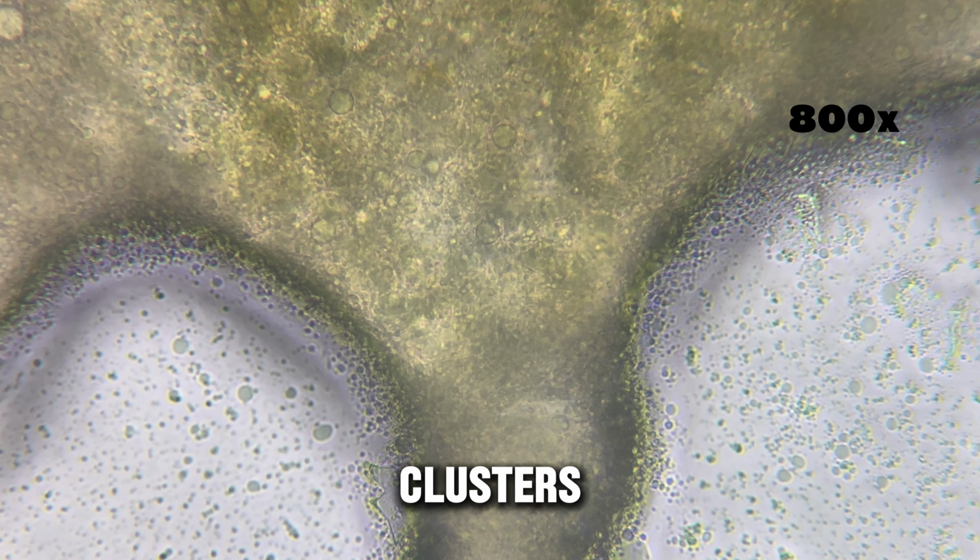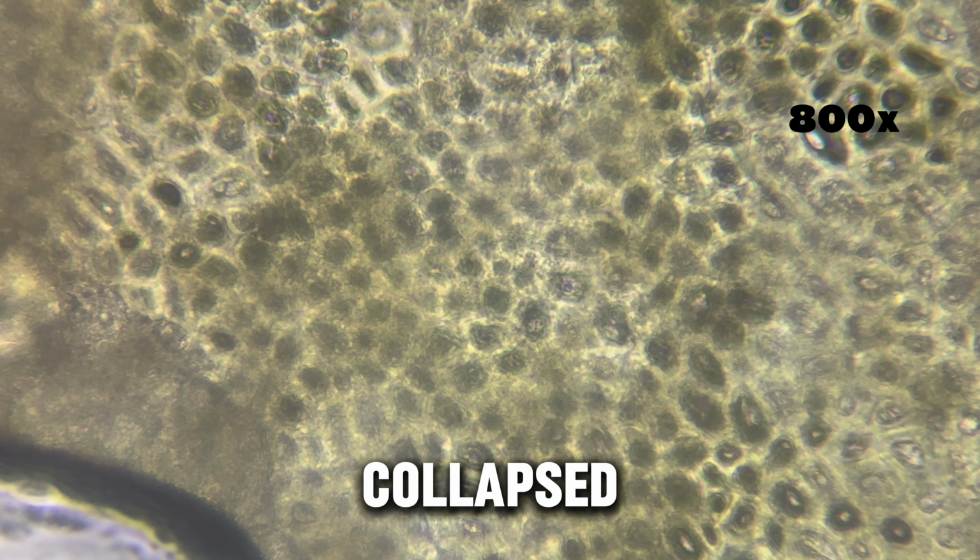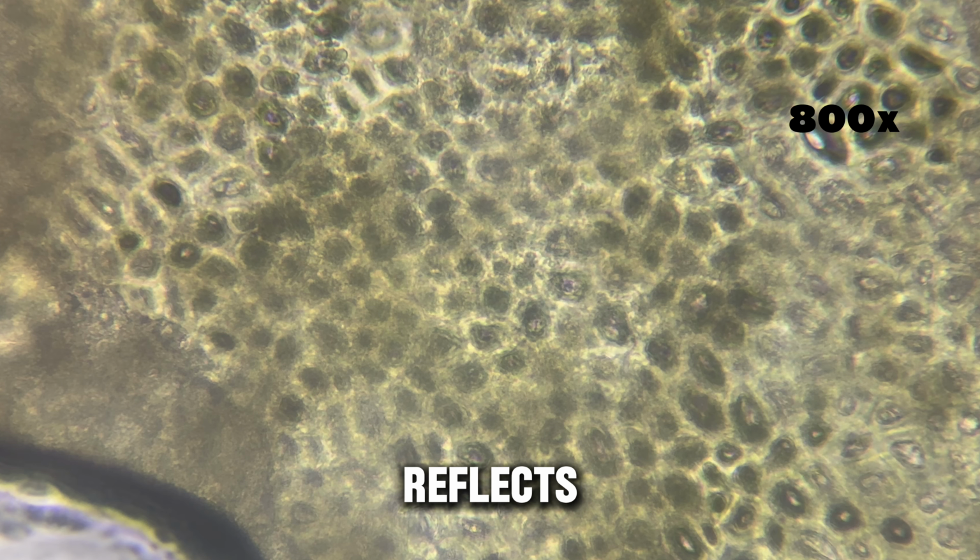Between the dense clusters, fine granular material spreads across the background. This material fills every available space. It creates a textured environment that feels layered and dynamic. Some structures appear fractured or partially collapsed. This reflects the intense grinding and processing of mustard seeds. Despite this, remnants of the original plant structure remain visible.